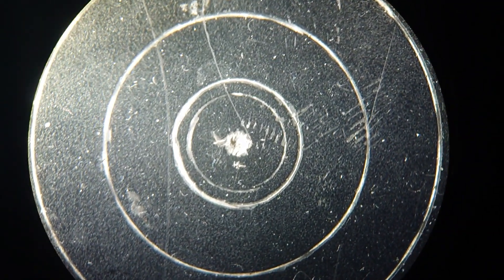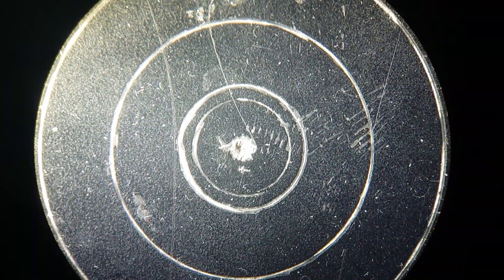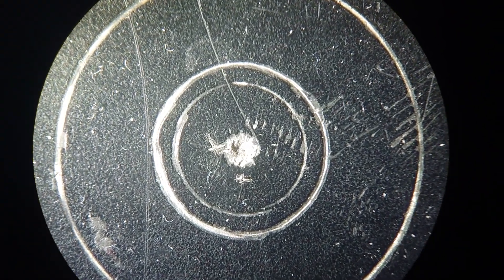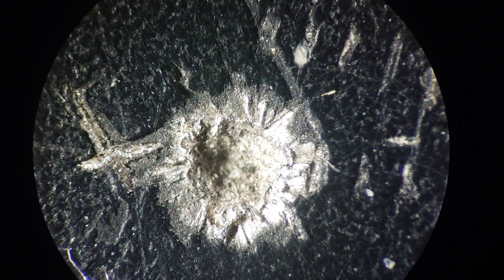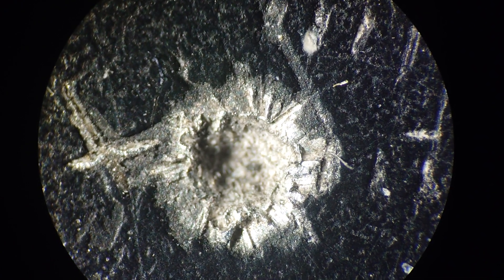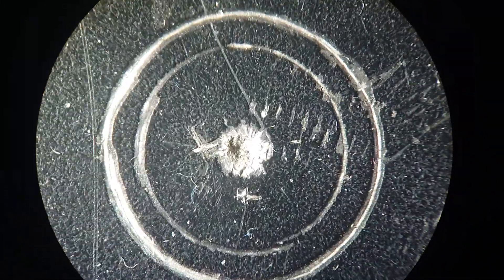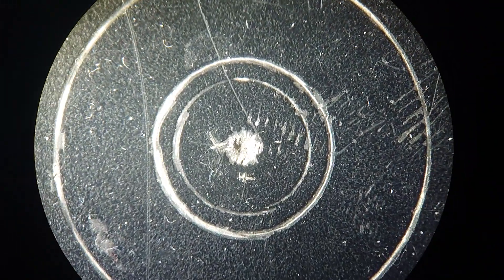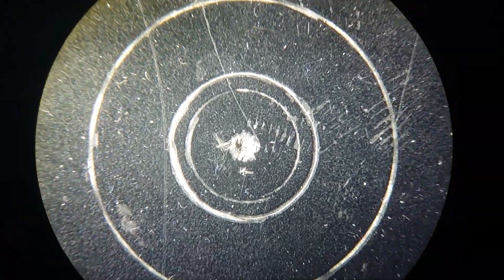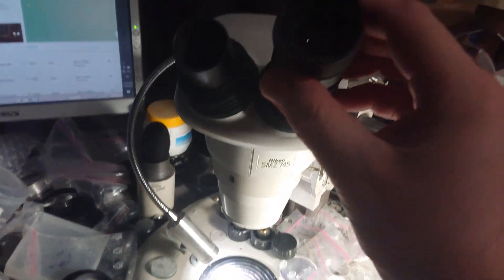Here's my usual plate to check alignment — this is the right channel. At minimum zoom, when moving upwards we see concentric movement of the field of view. Moving downwards, there's some kind of fast movement to the left and returning back of the field of view. I don't see it on the camera but I can see it with my eyes. That's the right channel.